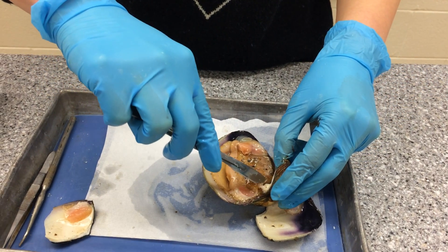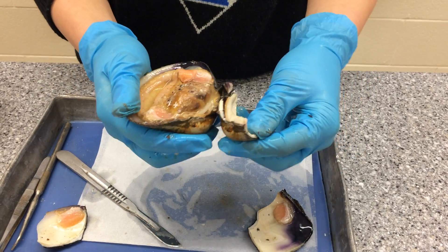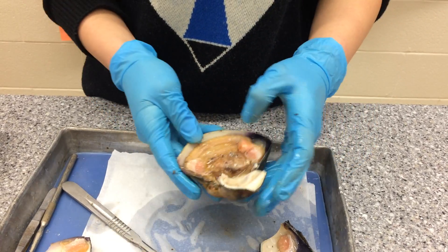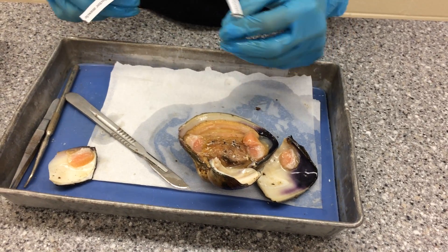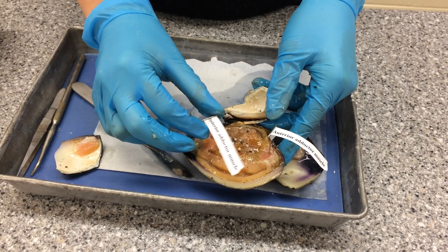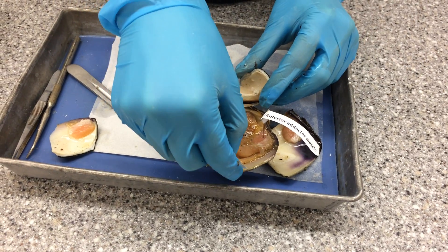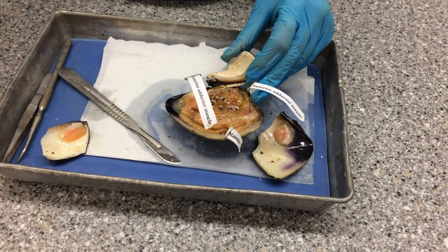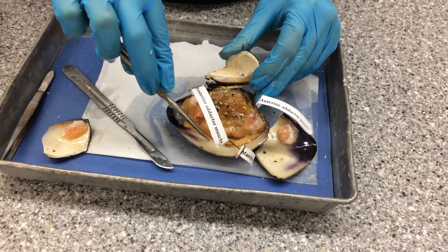I also need to cut these, which are the foot retractors. Removing this, you can see the hinge ligament along with these teeth which prevent any sideways sliding of the shell. We can see the anterior adductor muscle and the posterior adductor muscle which I just cut. You can also see the mantle right here, which is responsible for excreting the shell and also performing gas exchange. If we peel the mantle back here, you can see the pallial line, which is where the mantle attaches to the shell.